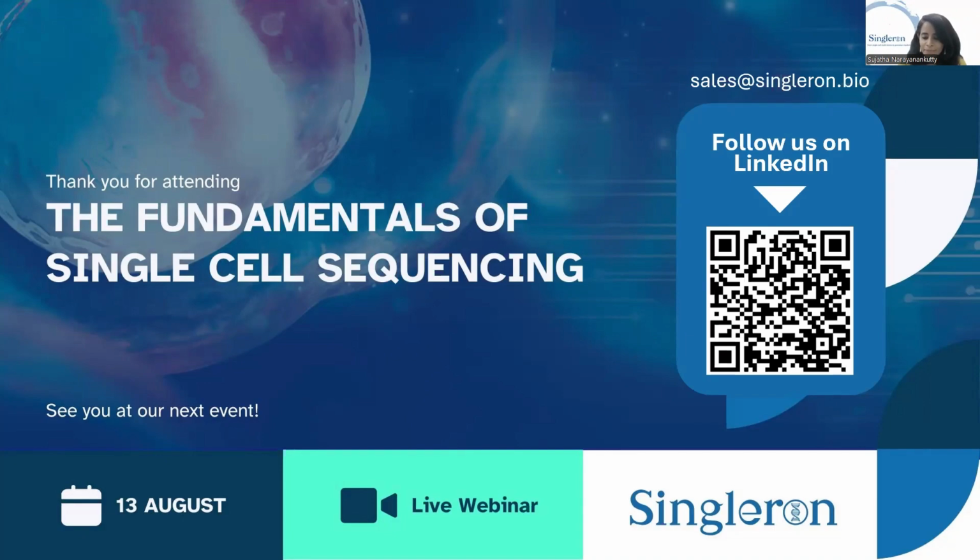Thank you, Dr. Sujata. Okay, one last question. Someone asked about single cell sequencing: because our beads are attached to the tag and used to label them, how does this work for single nuclei sequencing technology for frozen samples? Also, will the isolated nuclei stay separated, or will they aggregate during sample prep? I think this is something the audience would like to know.